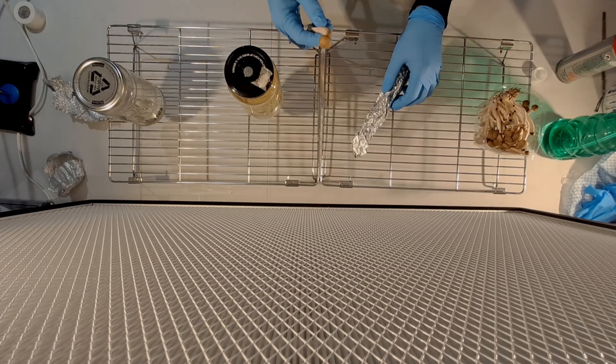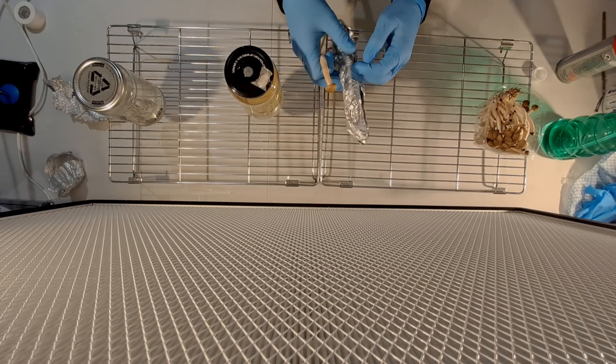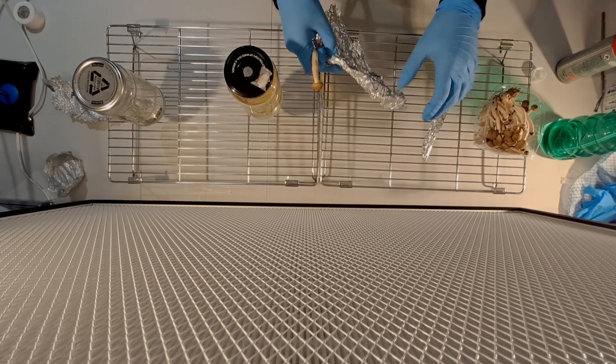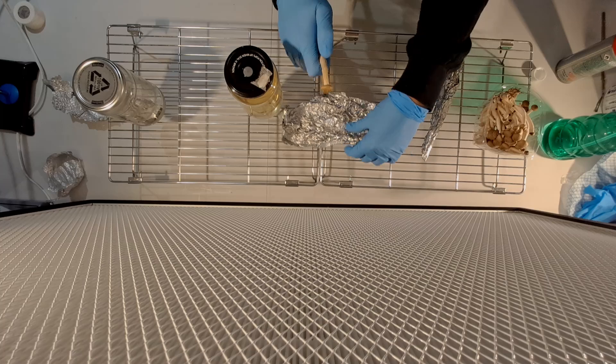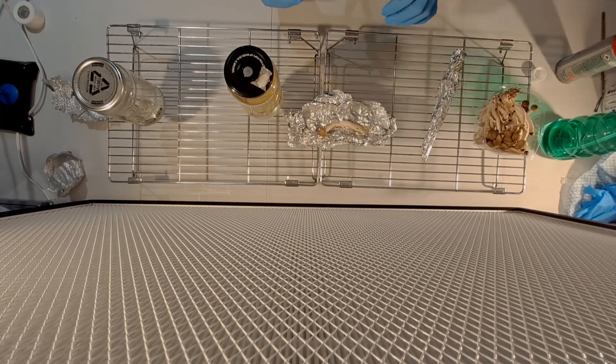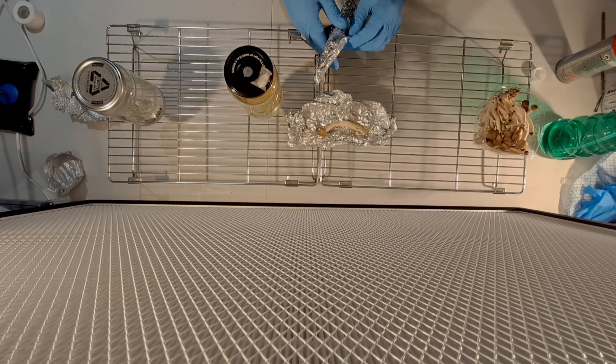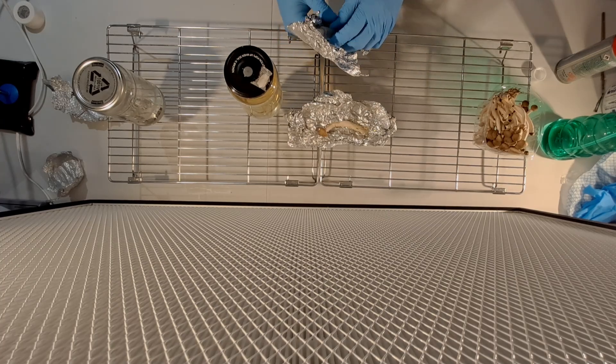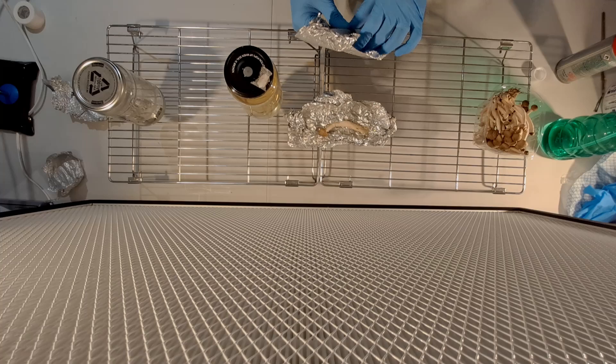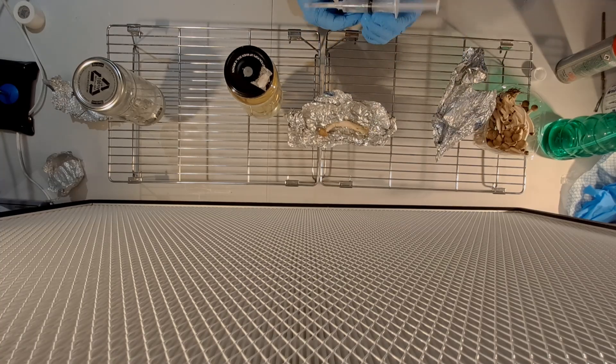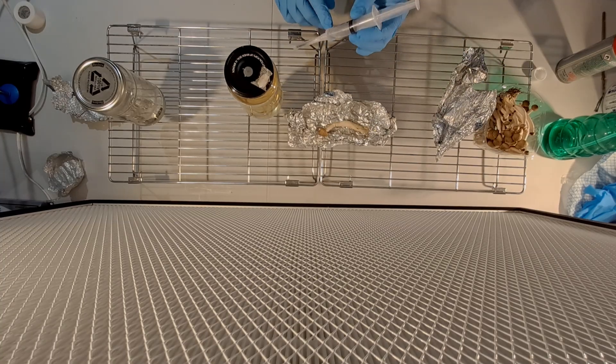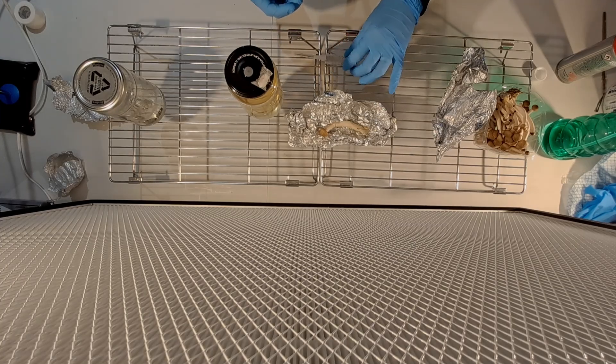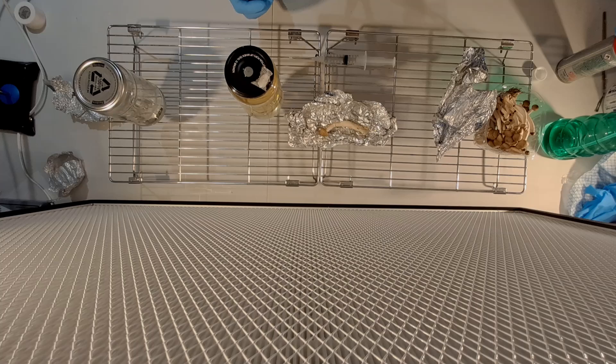Remove the syringe from the sterile double wrapped tin foil and you can use that as a placeholder if you want to put stuff down because the inside of that is sterile. The syringe and the needle underneath are sterile because they've come out of the pressure cooker and they will remain that way until you remove the cap.